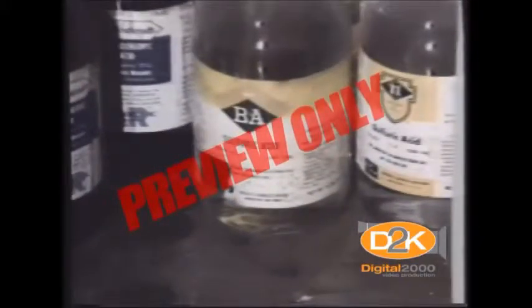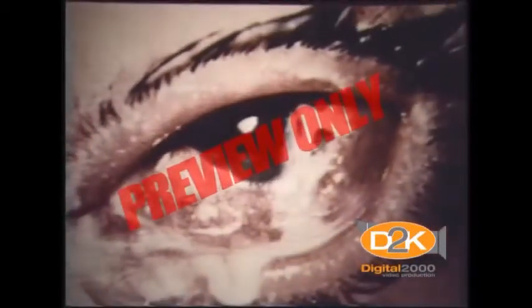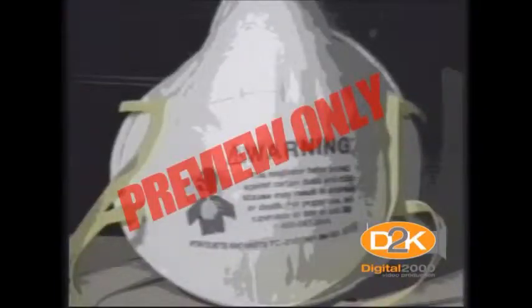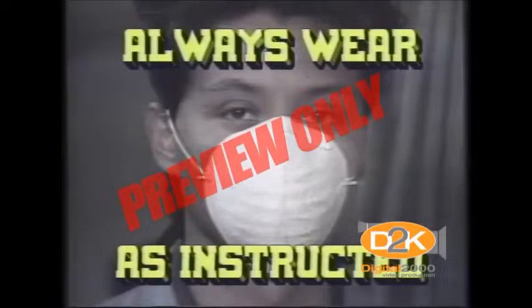A very small amount of hazardous chemical in your eye, such as sulfuric acid, chlorine, hydrochloric acid, and many others, can severely burn your eyes and cause permanent damage. Chemical gloves are necessary to prevent skin damage. Respirators prevent harmful vapors or fumes from entering your respiratory system. When required, be sure to wear these respirators according to your teacher's instructions.